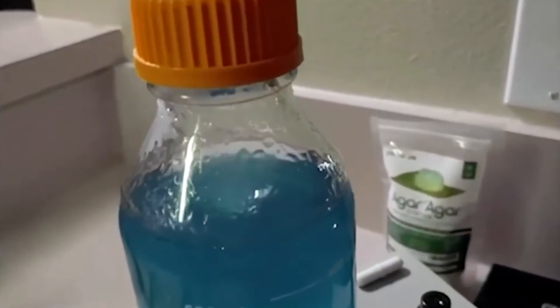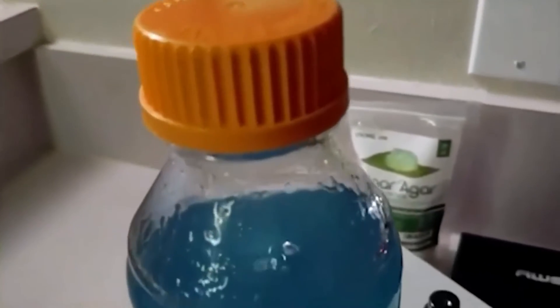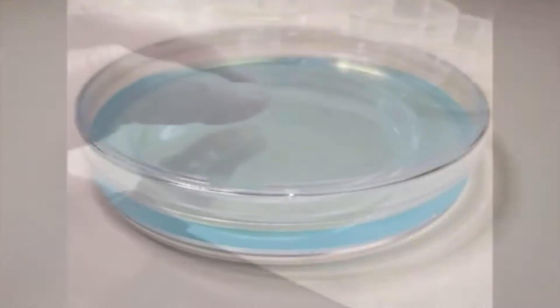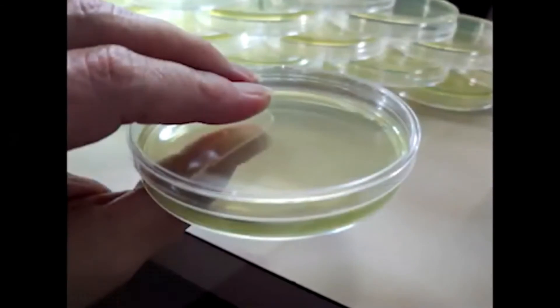When cloning or working with spores, we have found water agar to be the best recipe to start with. We then transfer to MEA plates. Then a final transfer to MYA gives us the rhizomorphic growth we desire.